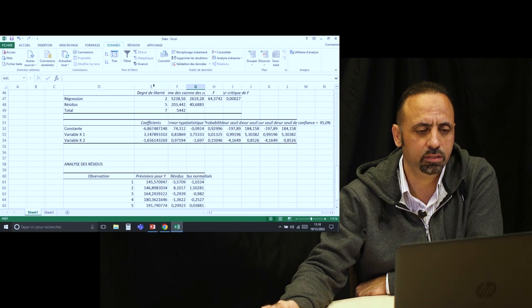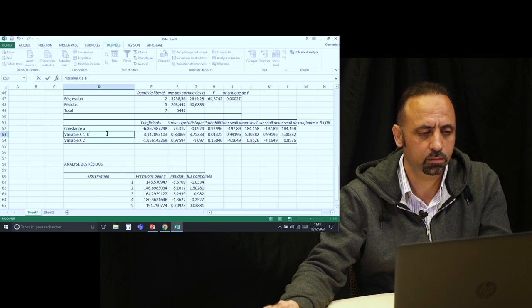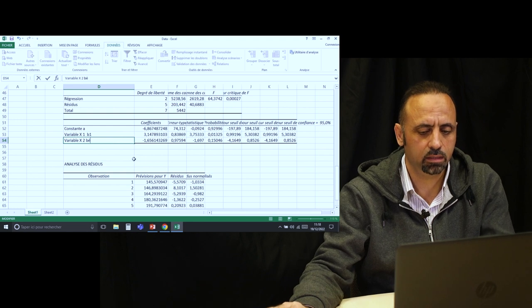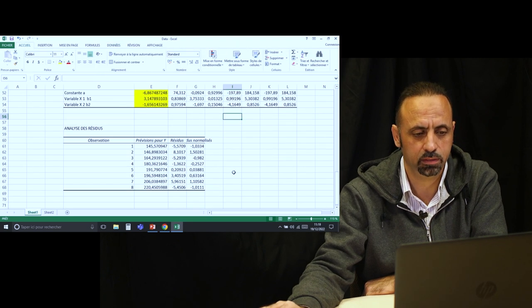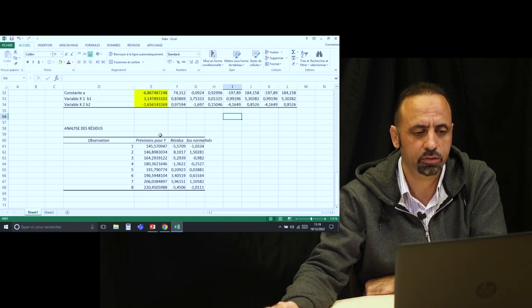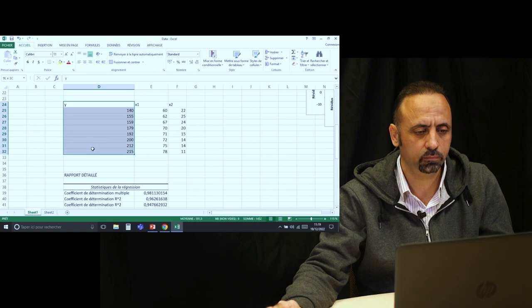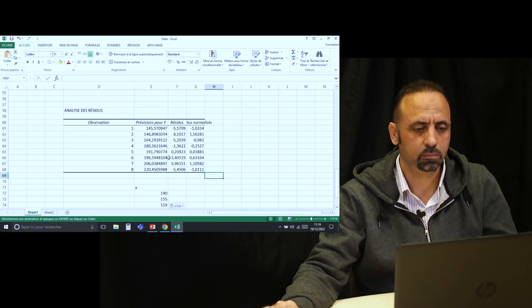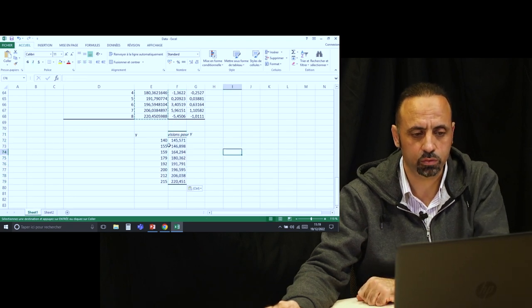From the regression output, you get the number of samples and the multiple linear regression coefficients. The intercept is A (or B₀), the next coefficient is B₁, and the following one is B₂. These coefficients can be used directly for prediction on unknown samples. The output also provides predicted values alongside the original Y data, so you can see how closely the predicted values match the actual data.